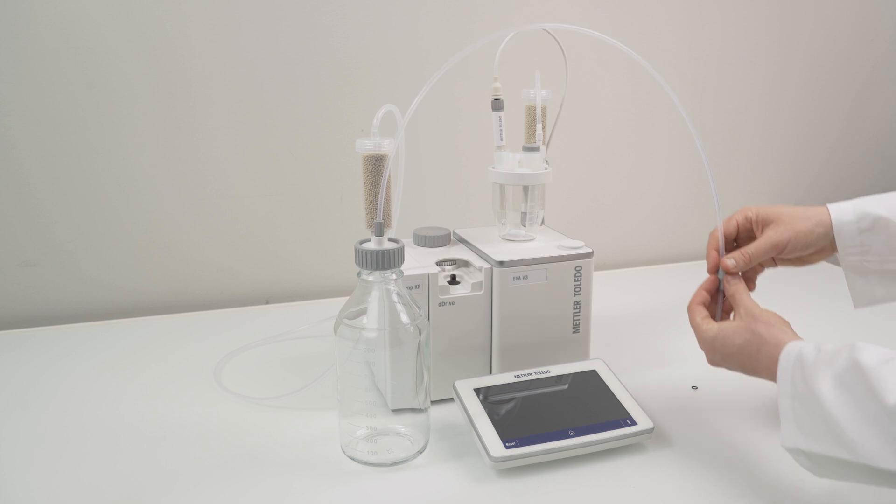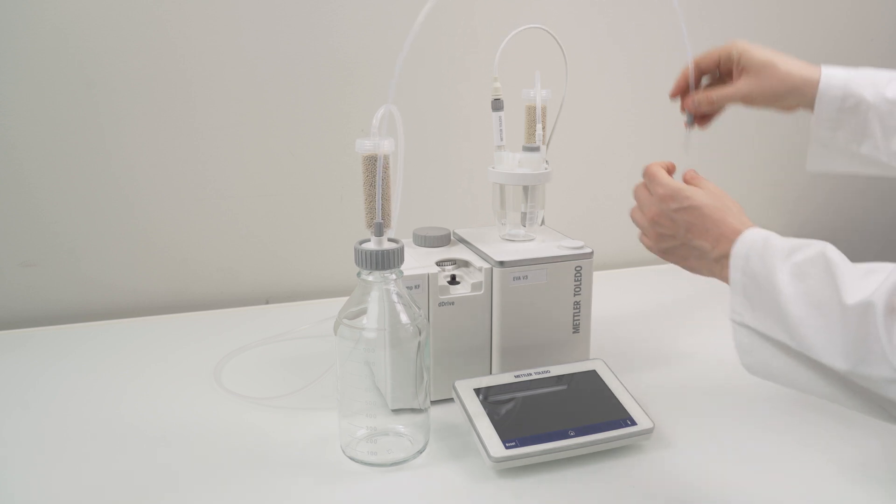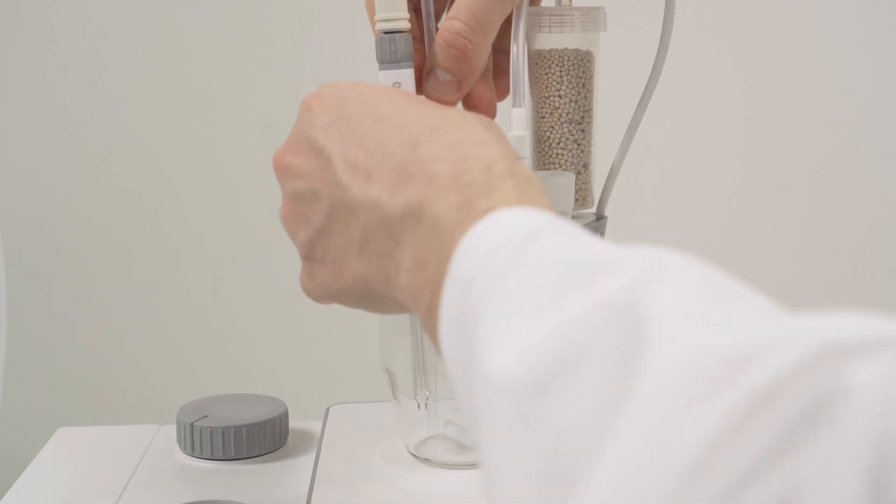Assemble the other end of the solvent tube the same way as you did before. Make sure that the tube is pushed down to the bottom of the glass vessel before fixing it with the nut.